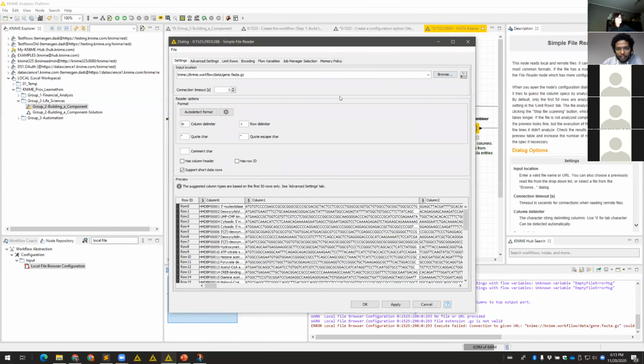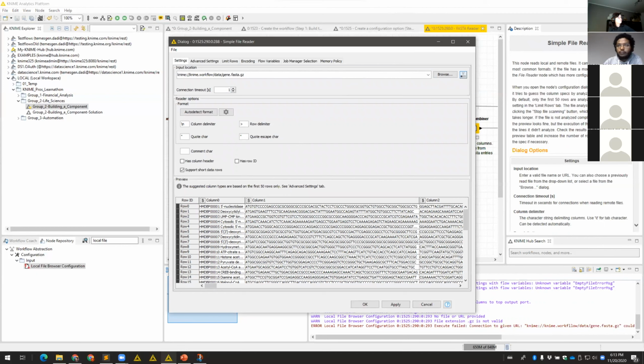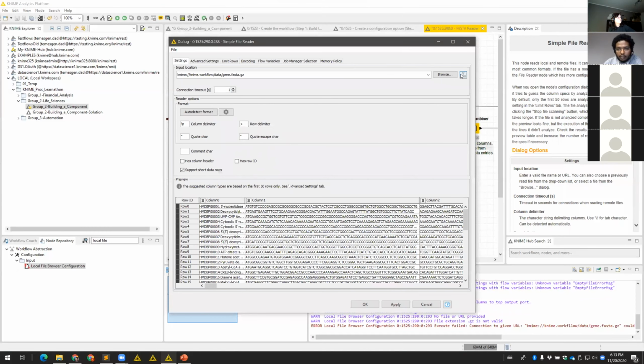And then we can come here and connect it to... where did my dialog go? Okay, somehow the dialog is open, but oh, it's not.